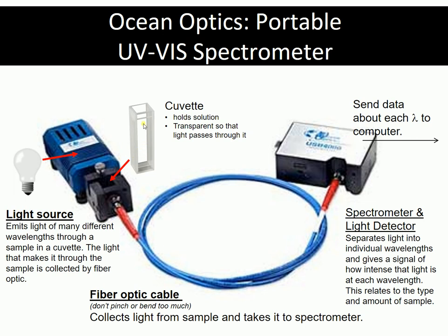And this is the cuvette that holds your sample and it's going to fill in about three-fourths full. There are two sides that are transparent so you want the light to go through that, and that will be placed inside this little tray right here called the cuvette holder.